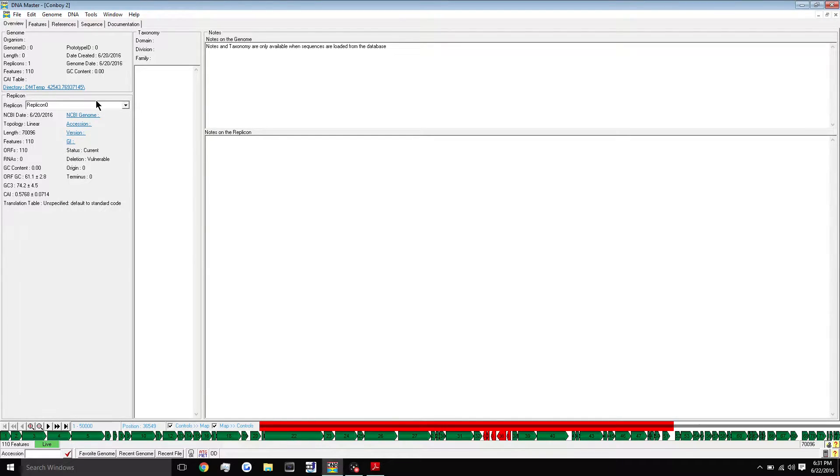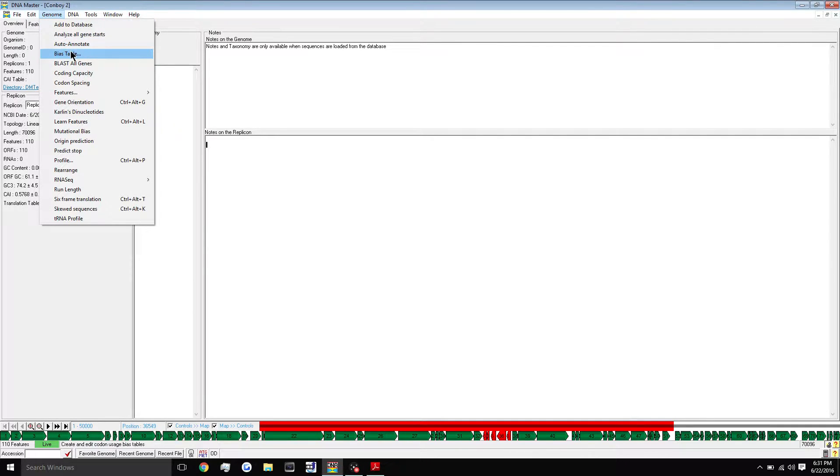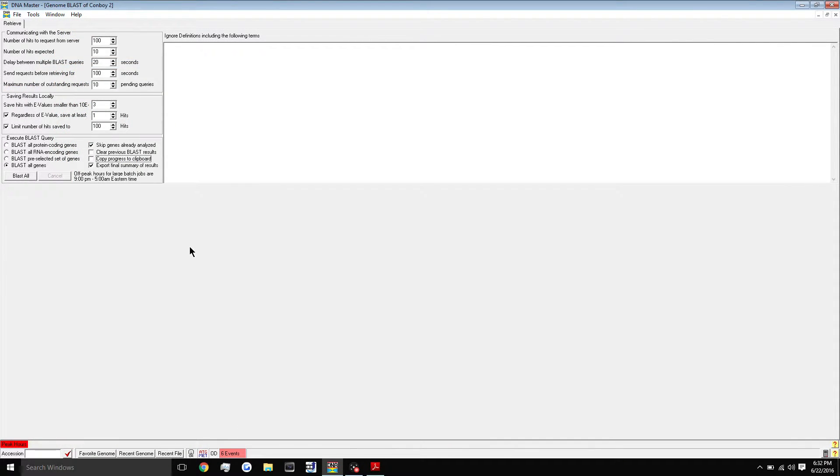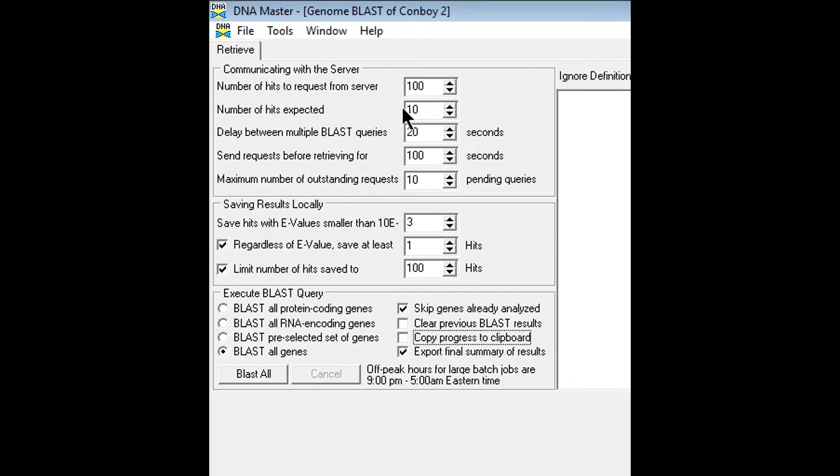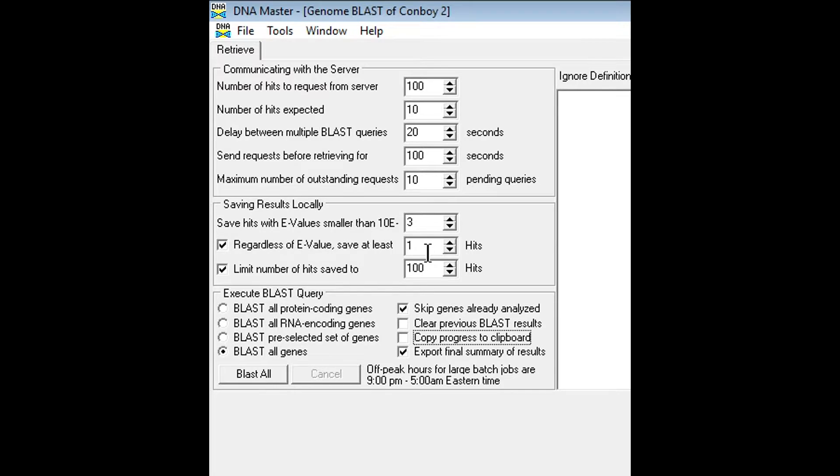To begin the blast process, go up to genome and click blast all genes. These should be the default settings for your blast here: 100, 10, 20, 110, 3, 1, and 100.